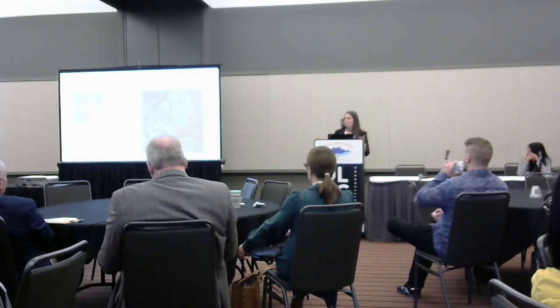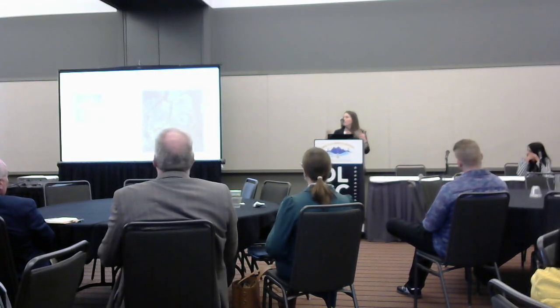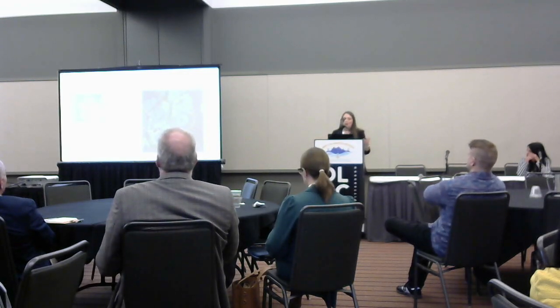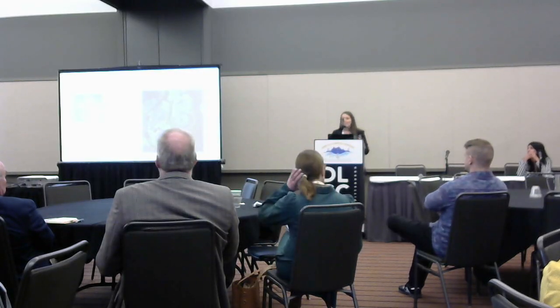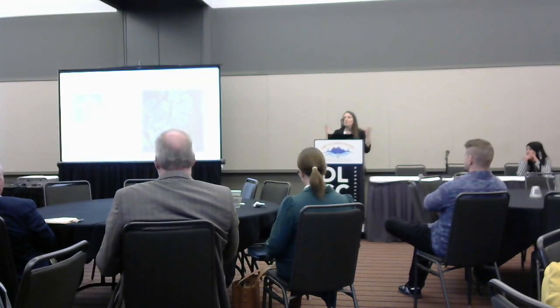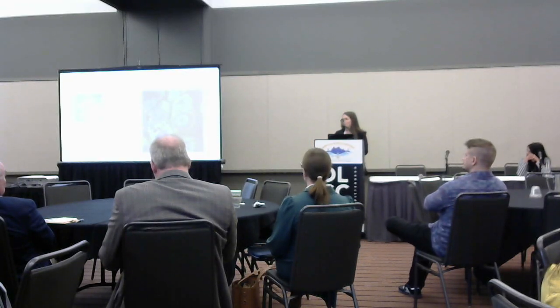So yes, they all represent, in fluorescence microscopy especially, how much light was collected from our sample. But thinking about it in terms of what we care about, every channel in our image has different components, like our signal of interest, the background, so maybe the stuff we don't care about as much, and then on top of that, noise. And all of these things can be impacted by any number of choices that we make in the imaging and analysis process that can impact how we choose our analytical methods downstream.